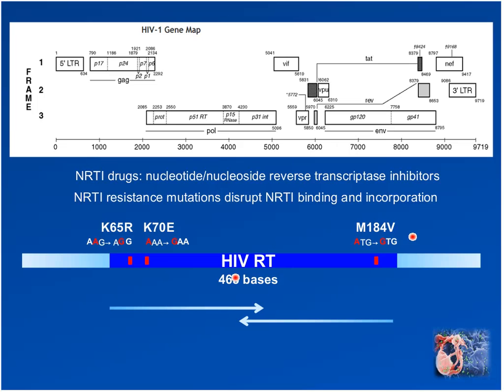Also, just to bring this back to the sequencing realm for a moment, for the 454 GS FLX Plus, this target can be sequenced in its entirety on the 454 system in the forward direction or the reverse direction. I did generate basically 485 base reads, so each read covers the entire target, either in the forward or reverse, or if you choose to do so in both orientations, which is what I did.